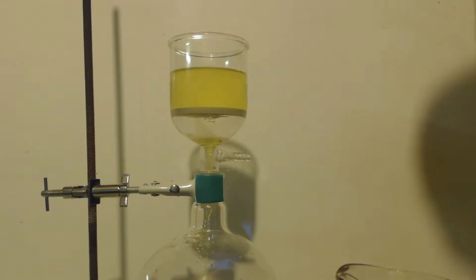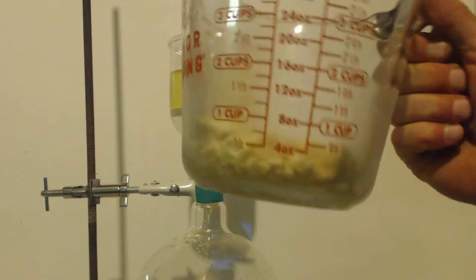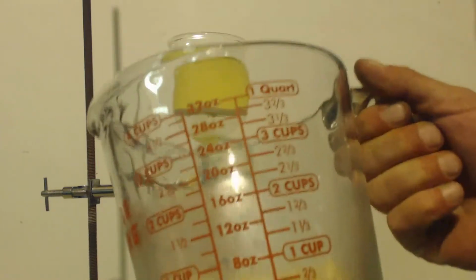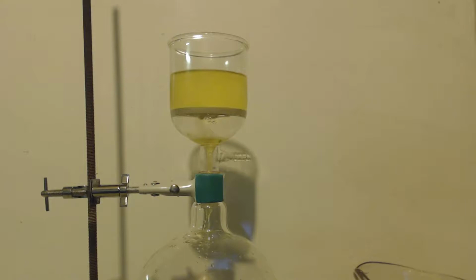And then I'll come back and we will make some sodium toluate, because this is toluic acid right here. This is the actual acid. It's not pure, but it's not a salt or anything. We want to make the salt, sodium toluate, or however you would say it. Just like with benzoic acid, you make sodium benzoate. We're going to do that here with this.